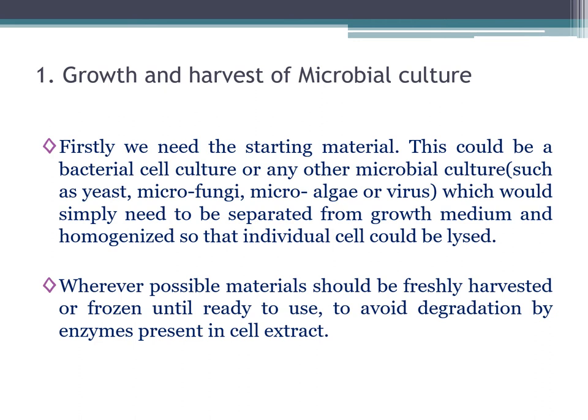Firstly, we need the starting material, and this starting material could be a bacterial cell culture or any other microbial culture such as yeast, microfungi, microalgae or virus culture, which would simply need to be separated from growth medium and homogenized so that individual cells could be lysed. Wherever possible, materials should be freshly harvested or frozen until ready to use to avoid degradation by enzymes present in the cell extract.